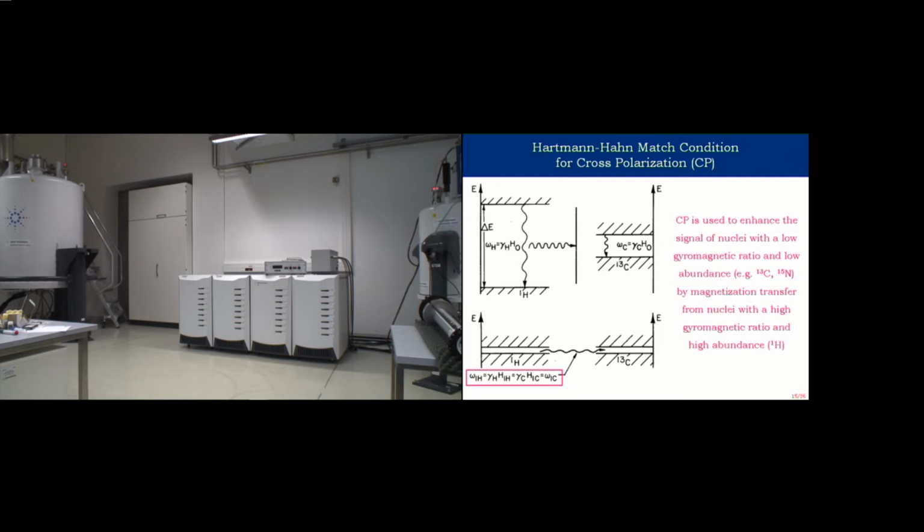So sometimes if you study small molecules where the number of carbons is not 100, it can be that in one molecule no carbon will be magnetically active. Of course, there is a method to enrich the system by isotopic chemical methods, but usually this is very, very expensive and sometimes not possible.